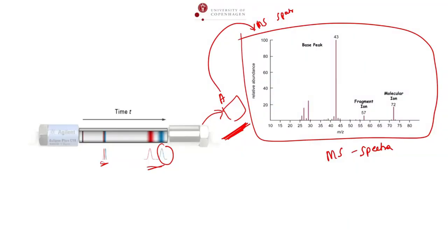And structure talks about composition. The mass spectrometer is a fantastic thing in the world that talks about the structure of the molecule based on the mass. It also gives you the fragmentation pattern. For example, this is the fragmentation pattern. This is the mass of the ion. It has a parent ion and fragment ions here. And this is unique for each molecule, right?